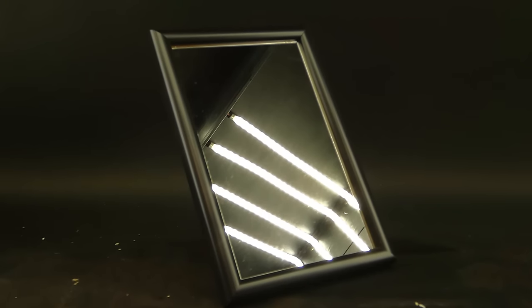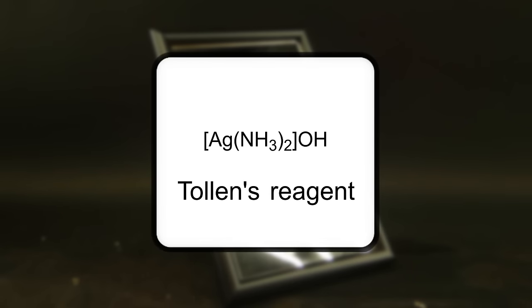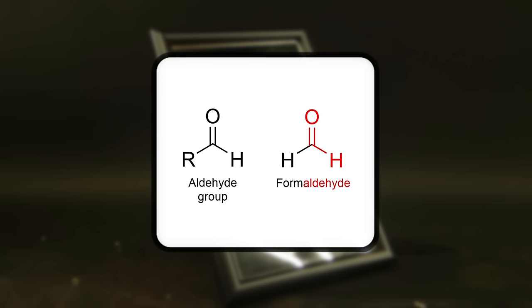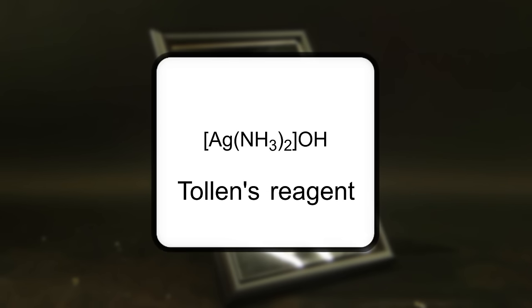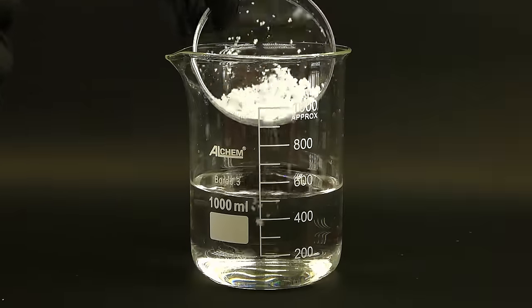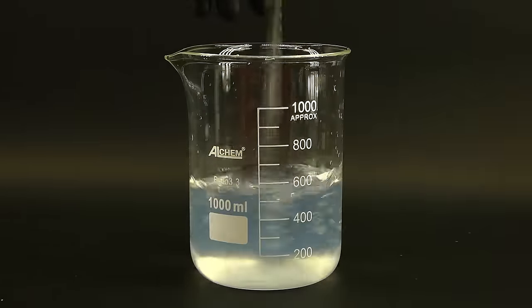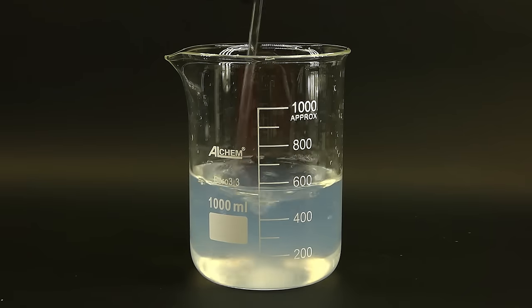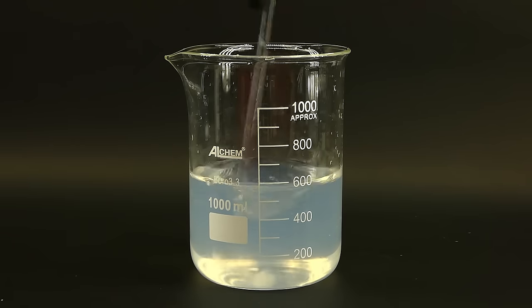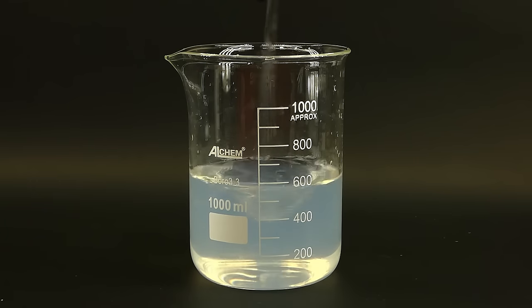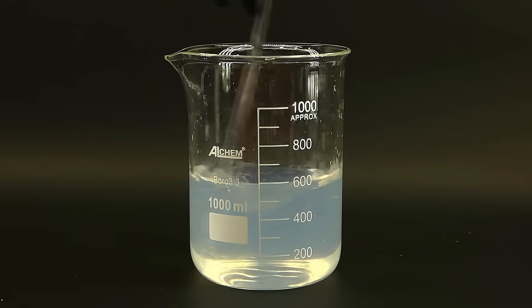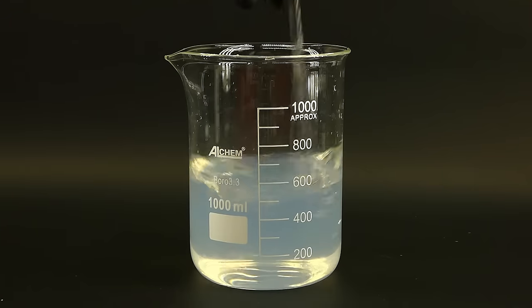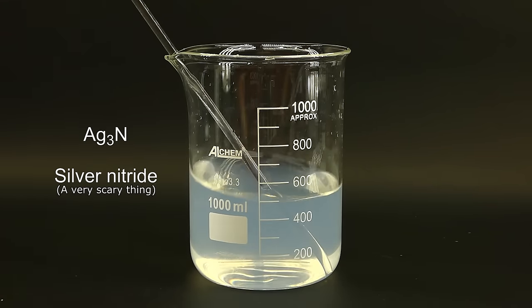To do that, I will have to turn my silver nitrate into something called Tollens reagent, which is a chemical often used in laboratories to detect something called an aldehyde group. It is really useful, but I won't dive too deep into how it works, because all I want is just to make some mirrors. To start, I first dissolved 8.5 grams of my homemade silver nitrate in about half a liter of distilled water, which made a weirdly cloudy solution. It will be a stock solution, and I will use small portions of it to prepare the Tollens reagent, because it has to be used quickly after making it, since with time it decomposes to the incredibly explosive silver nitride, which I definitely don't want happening.